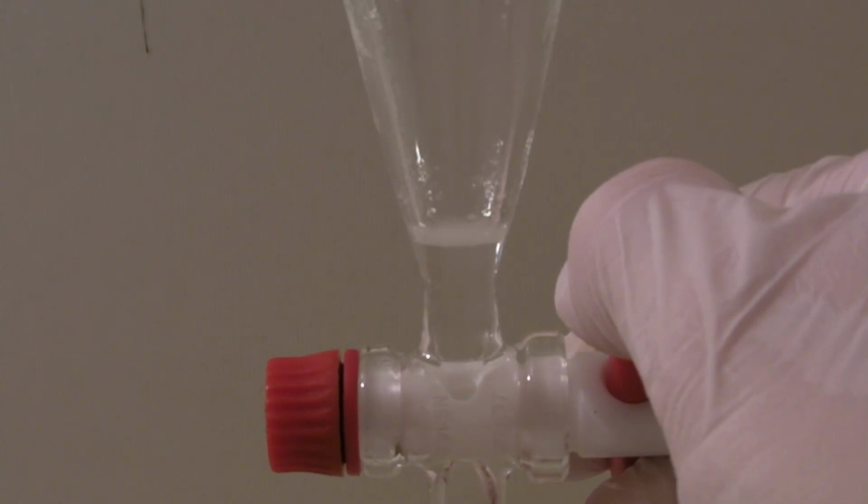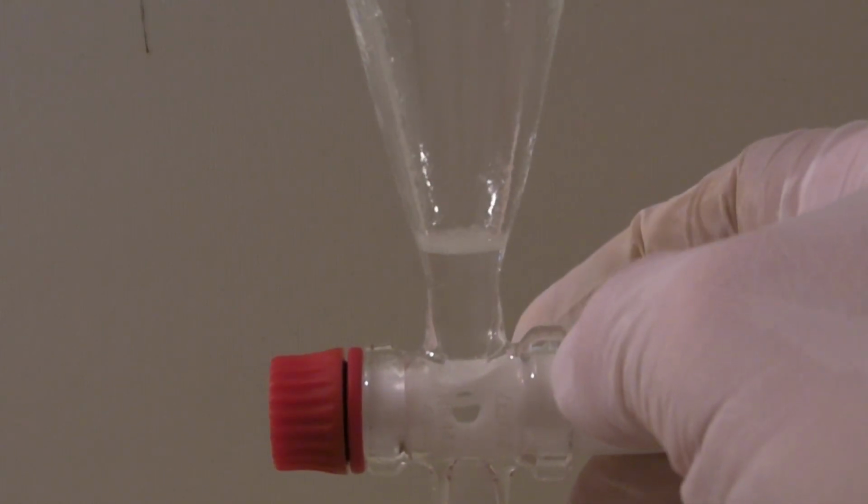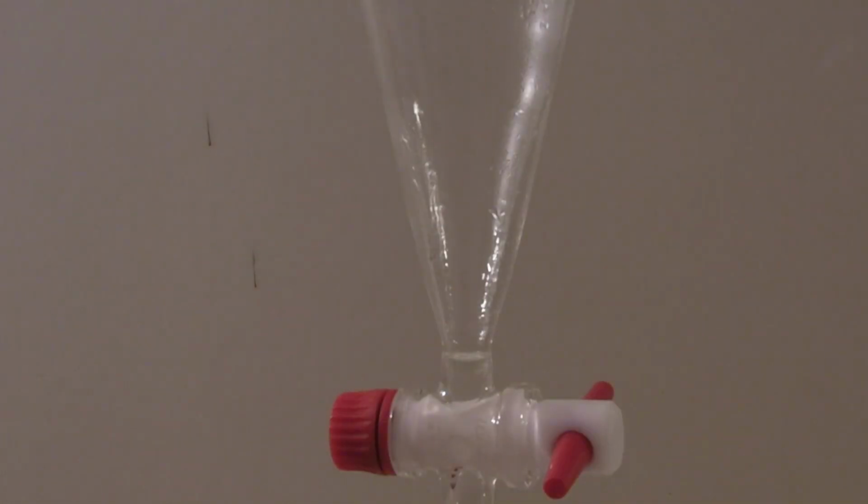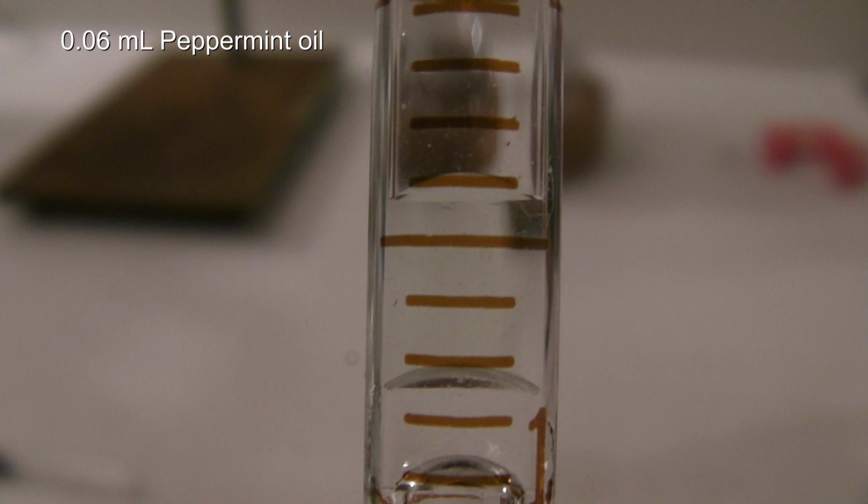This also has to do with a lot of the oil sticking to the walls of the flask and the funnel. In addition to that, some of the components are slightly soluble in water, which also decreases the yield. By adding a bit of water and using a graduated pipette, the amount of oil could be determined. 0.06 milliliters of oil were obtained, which corresponds to a yield of 0.14%.